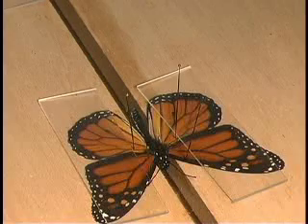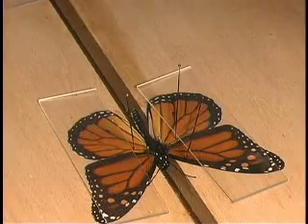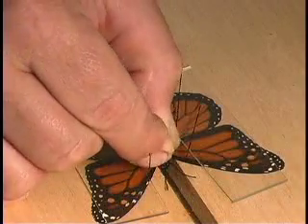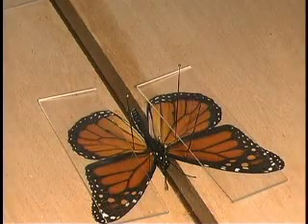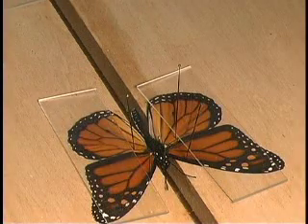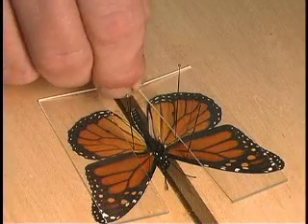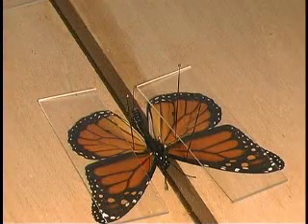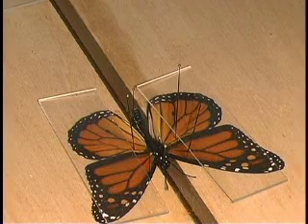Now, once you've placed your glass strips or your paper on the wings to hold them down, make sure that the antennae are properly positioned. You can do that using your insect pins so that the antennae are as flat against the board as possible and out in front of the insect. That will keep you from breaking the antenna when you put your labels on later after the insect specimen is dried. Also, make sure that you position the abdomen so that it is as straight behind the thorax as possible. And once that is done, you're finished.